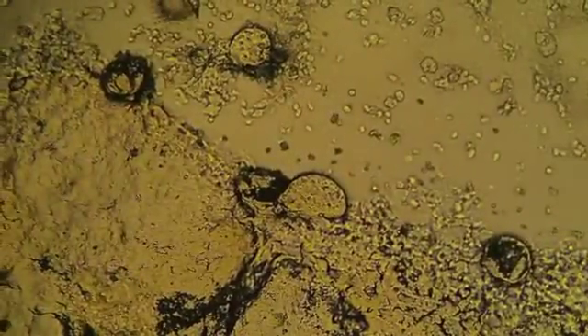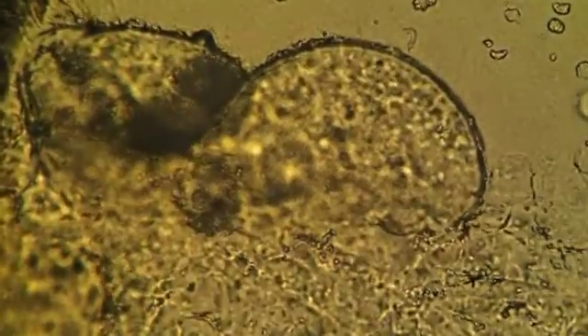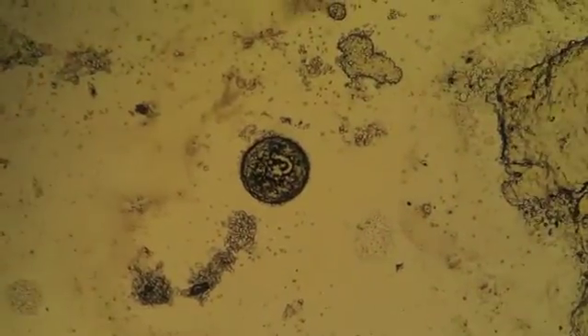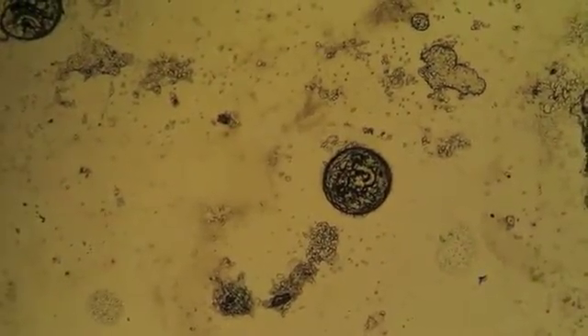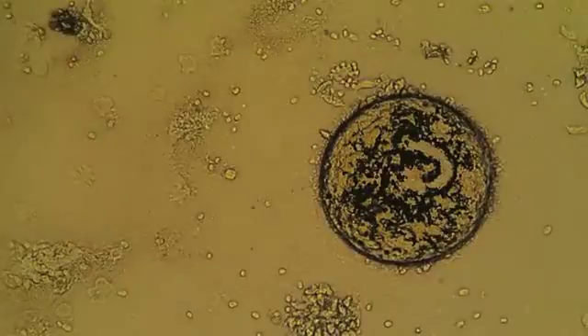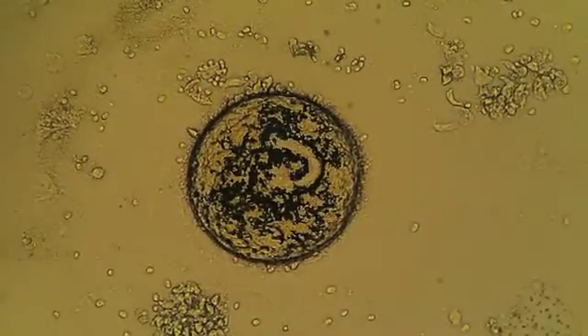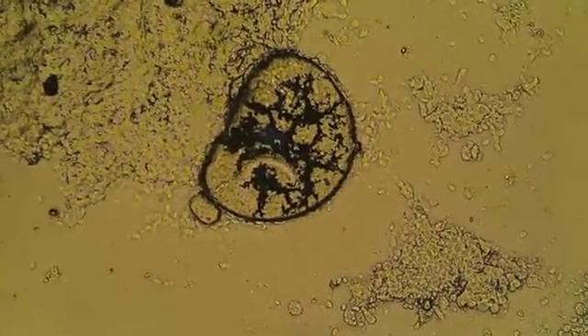You can see here these guys are trying to encyst onto the skin, hence the shape isn't quite round. But you can notice that they are completely different from everything else around — this is how your eye gets pulled in to look for them. We're still looking at it at four times objective. A lot of people talk about the horse shoe shaped nucleus — and here it is, though it's not present in everything. Zooming in and out, you can see the horse shoe shaped nucleus in the center of this critter, and if we move around here, you can see another one there forming the horse shoe shaped nucleus. We're at ten times objective lens now.